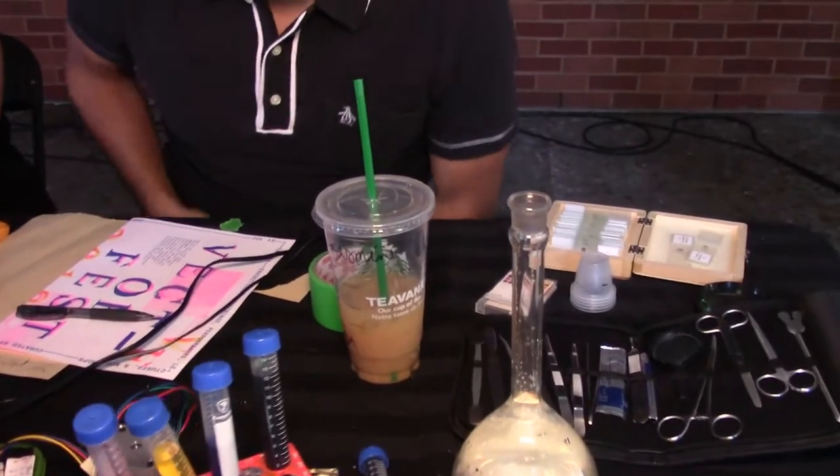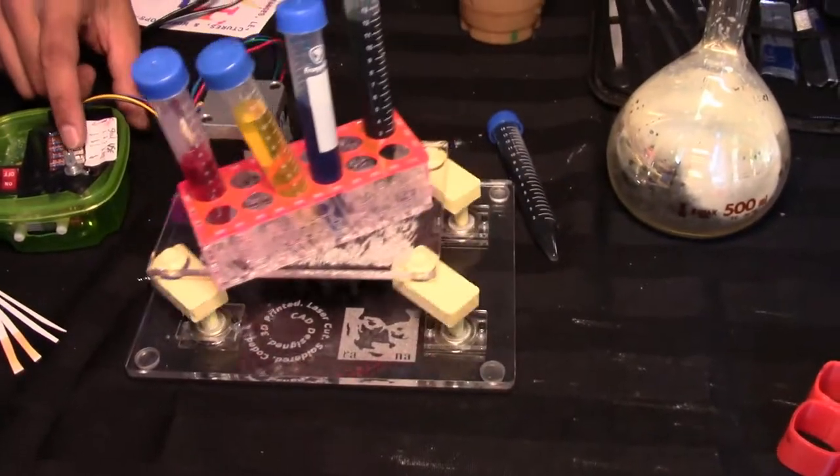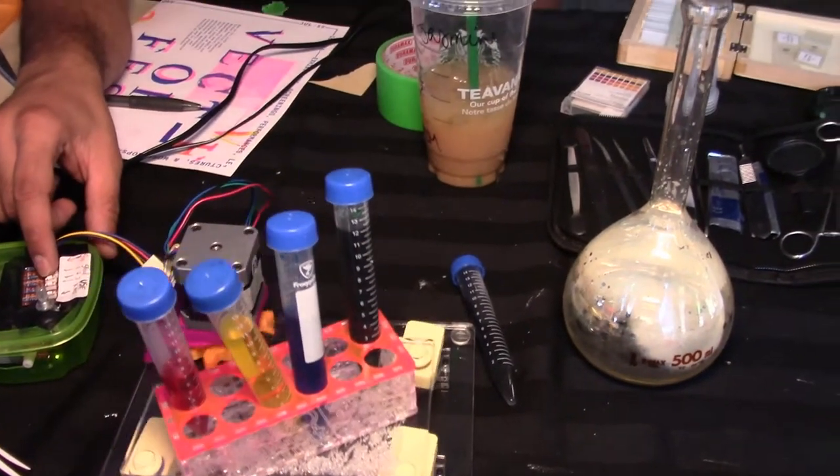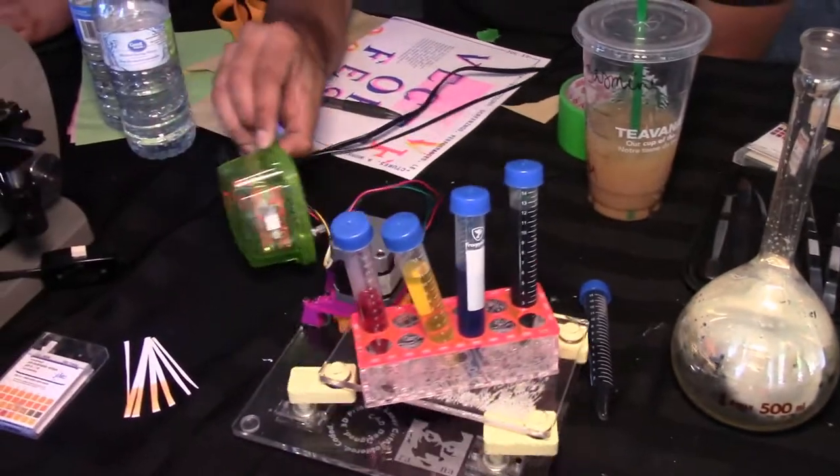Take a look through a microscope. Rana, could you tell us about all of this equipment? That's the mixer, the tube mixer that I made. It mixes gently and has a little speed adjust. Is it running Arduino? Yeah, it's got an Arduino Nano.